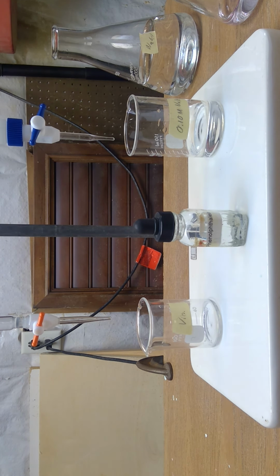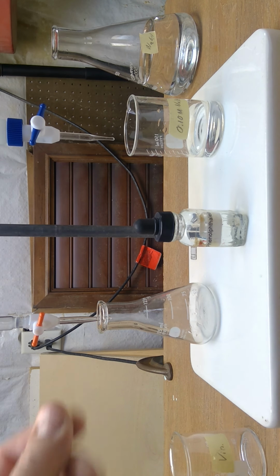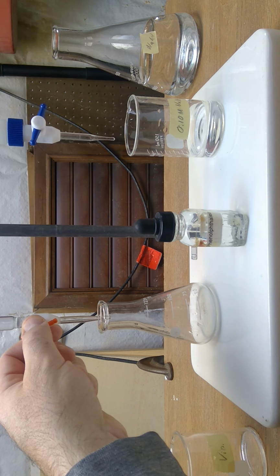So now what we're going to do is the same exact thing with trial 2. Now instead of refilling this burette, we can go ahead and start where we ended. So our initial reading for our NaOH will be 20.41, and our initial reading for our vinegar will be 32.00. Okay, so we'll put this one aside, and we need to do it again. So I got to add exactly 2 milliliters. I got to go to 34.